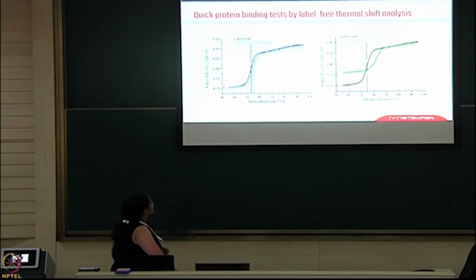Now, this is a thermal shift assay that we have done, where we have taken a kinase, and the kinase is treated with a ligand molecule. You can see the shift in the assay. Protein alone was giving a shift at 50-55, and once it is added with the ligand, the shift has gone to 62. So, that is how you can check the thermal assays.